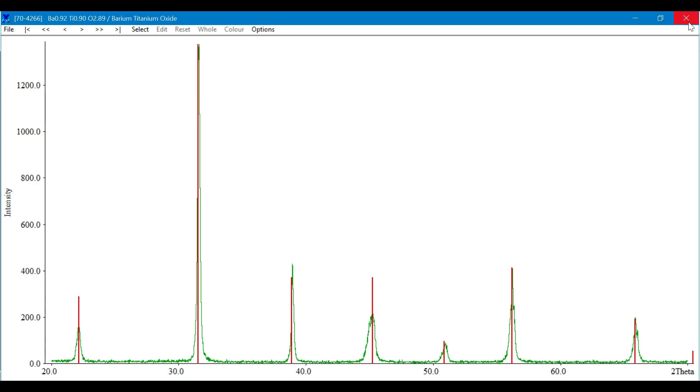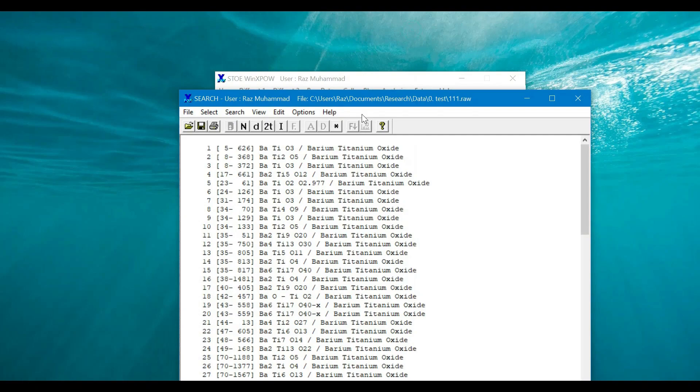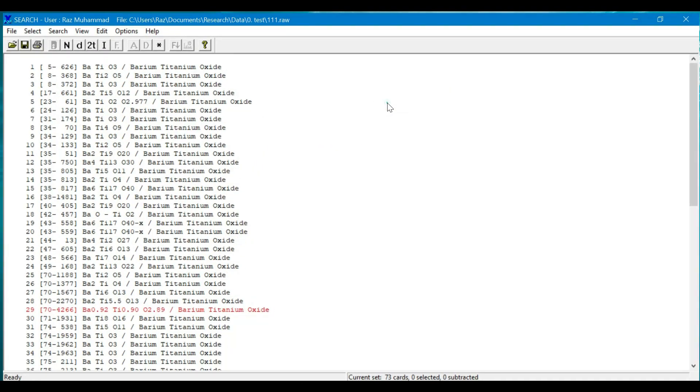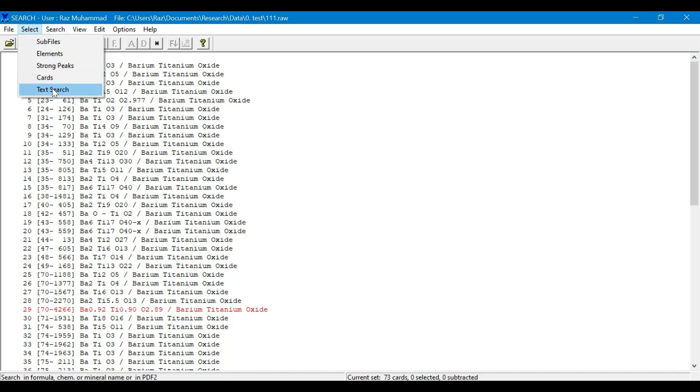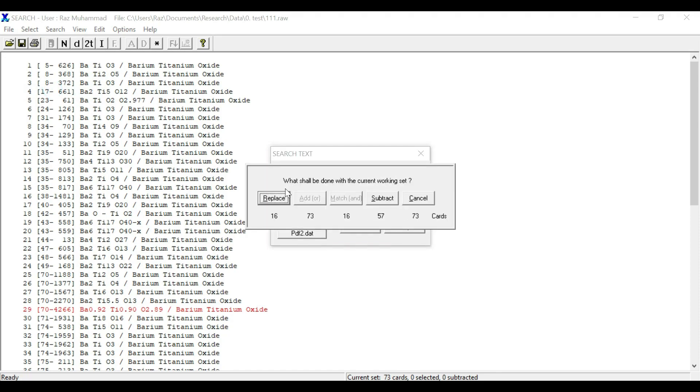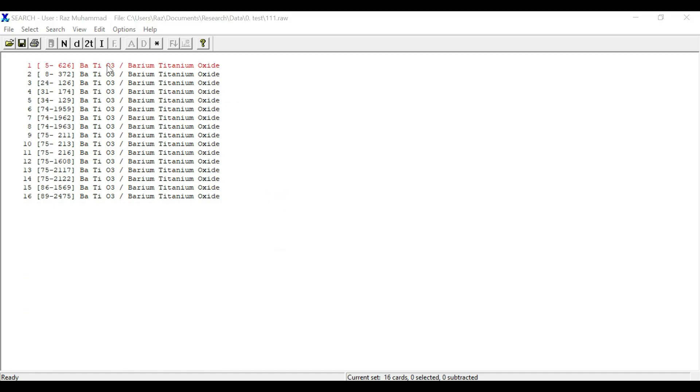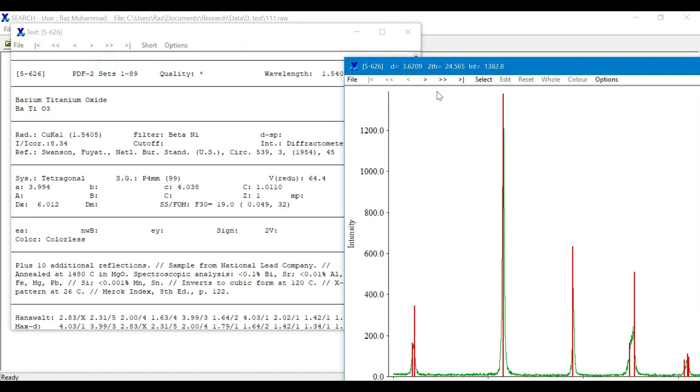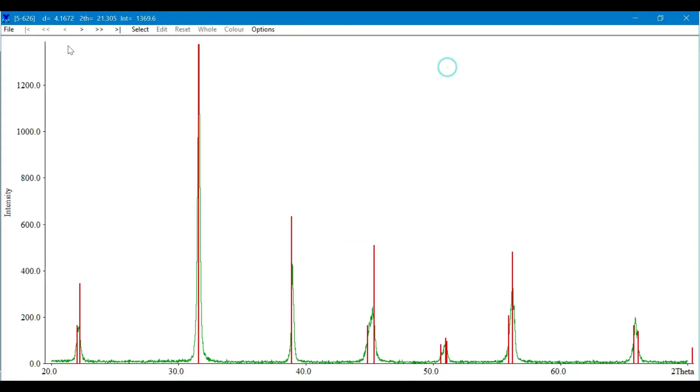In another way, you can also search your desired file directly by selecting the text search option. Here you need to enter the exact formula of your compound, and it will filter out just the specific phase of your material.